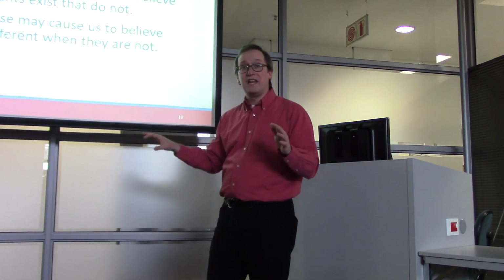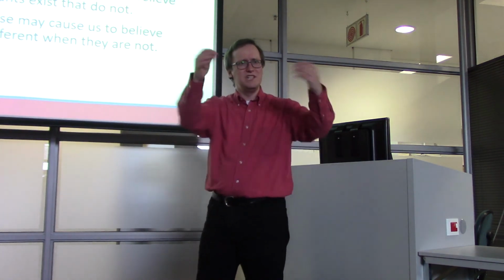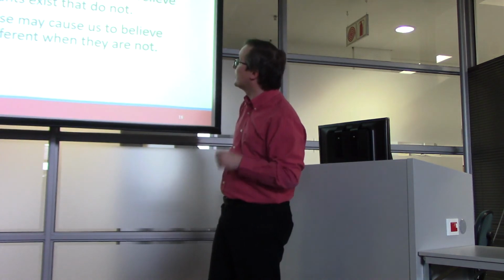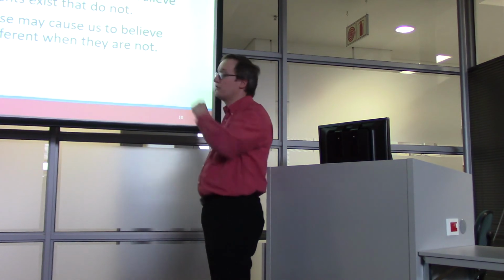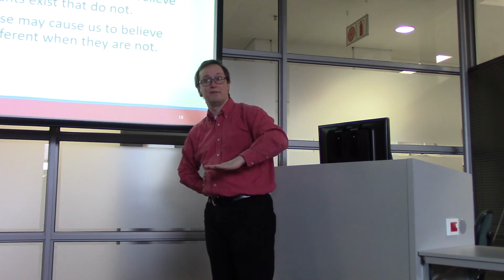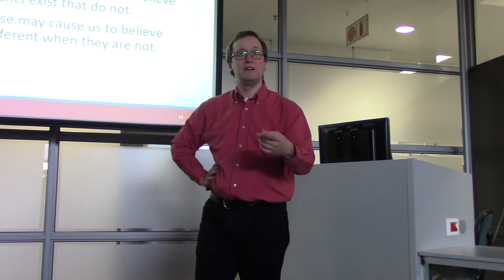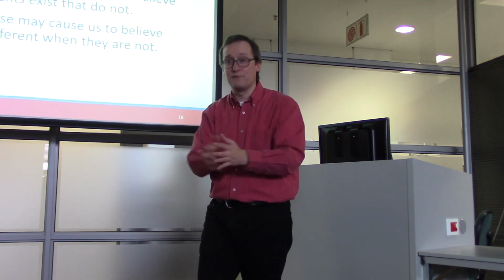So why else might read counts be a terrible way to work? When I say read counts, by the way, I mean that very literally. We have DNA reads from our sequencer, and we're just counting how many times we have a hit on this particular subsequence. So it could be that we've done a multiplex primer assay, and some of those primer efficiencies were close to 2, and some were closer to, say, 1.5. That's a bad scenario, because now those sequences that were associated with highly efficient primers have been amplified at a much greater rate than those that had less efficient primers.